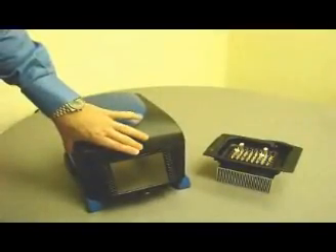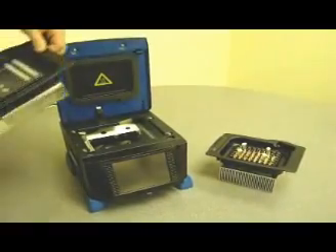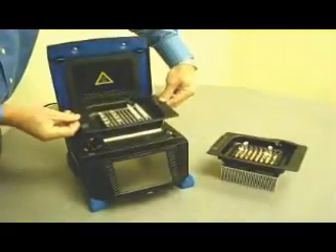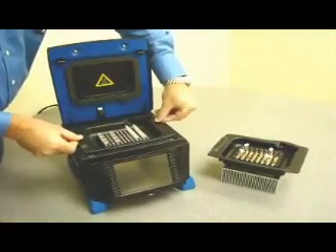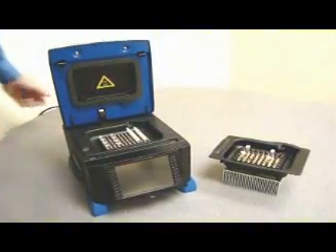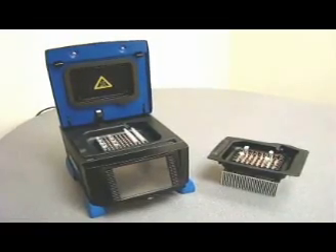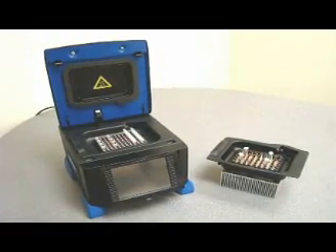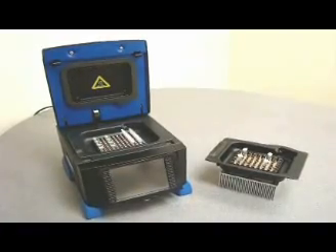Amplitronics' unique design allows installation and changing of blocks in merely seconds with no tools required. Simply drop the block in place and push to engage. By simply purchasing additional blocks, you can scale up your Amplitronics machine. The A6 is one very versatile cycler.